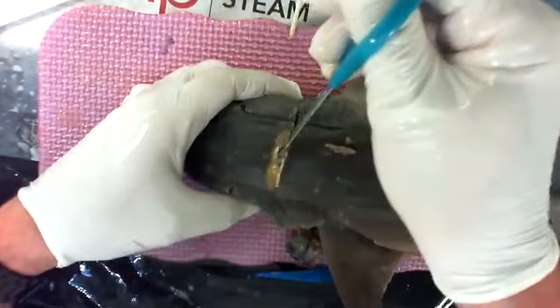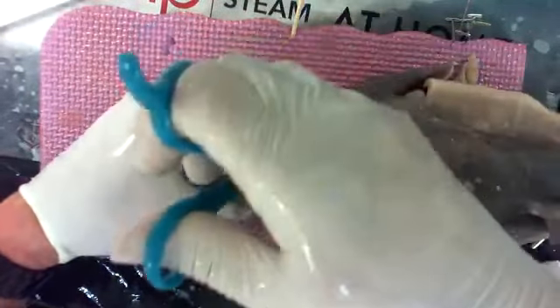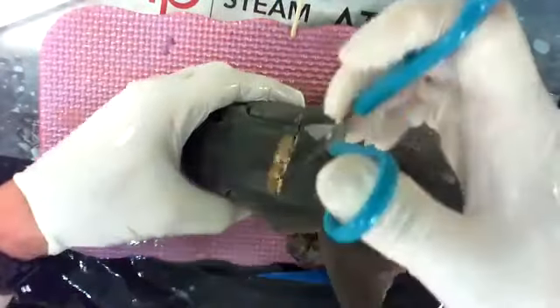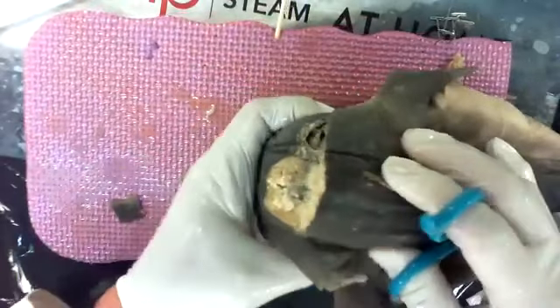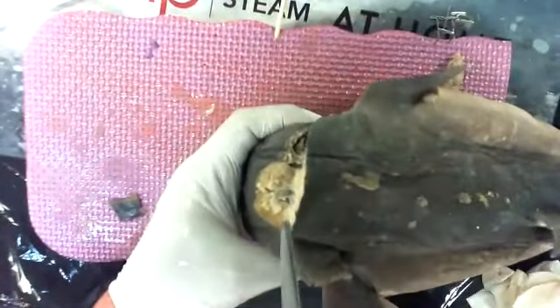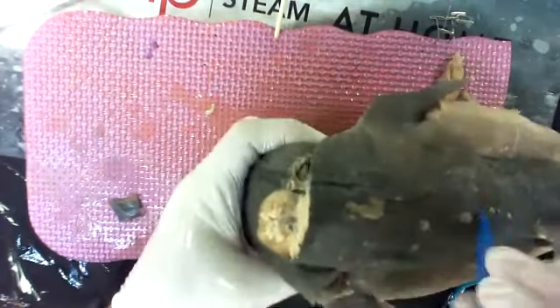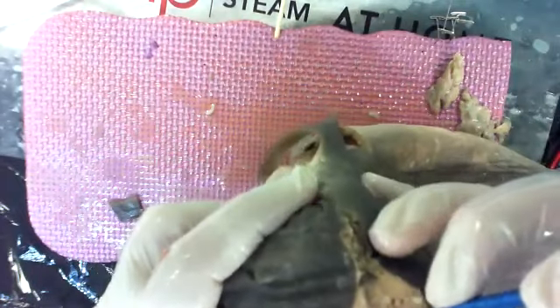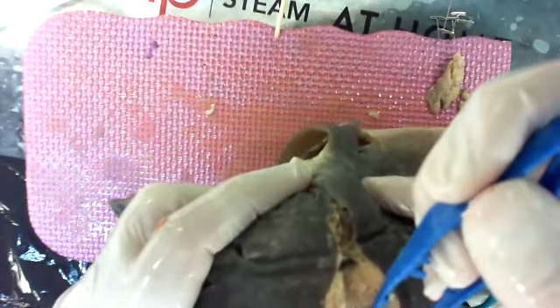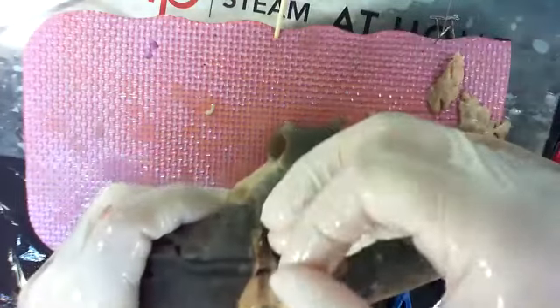I'm hitting a bone. What do you think that bone is right in the middle? It's the vertebrae. So I'm going to go around that bone like this, if you can see it, and snip. I just cut the vertebra. I can bend this like it's a lobster or a crab, and I'm cracking it open. And right there I see the vertebra. You can see the round disc. And there's the spinal cord. I don't know how well you can see it. I can touch it. Squish, squish, super squishy. Pretty cool. You can take your pin and poke at it.